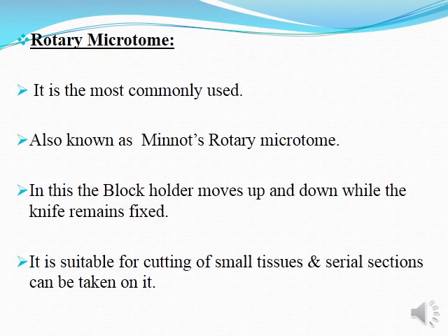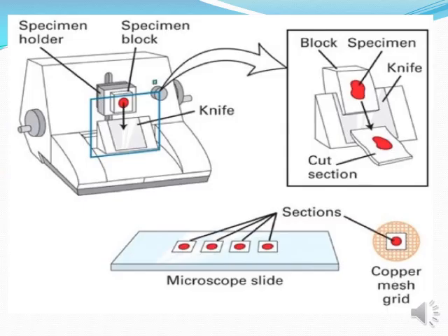How does the rotary movement work? So this is how it works. You put the block here. This is a knob. Here there is a motor. So when we rotate, there will be a rotating section coming on. This will be taken into a motor.